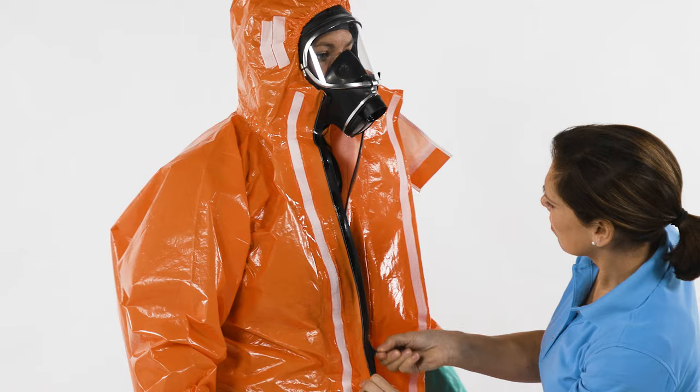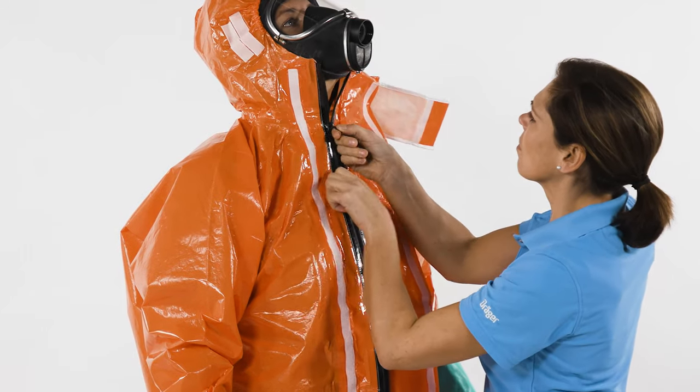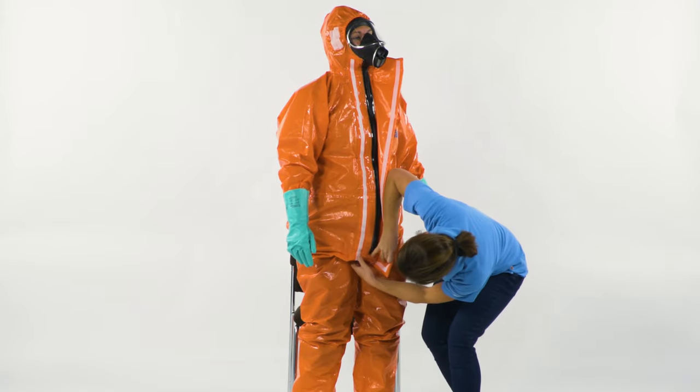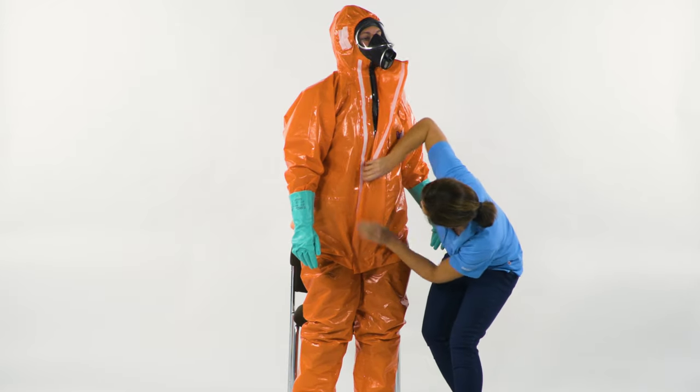Have a second person close the zipper and the flap. Make sure that the hook and loop fastener is completely flat and that there are no air pockets or unsealed areas.